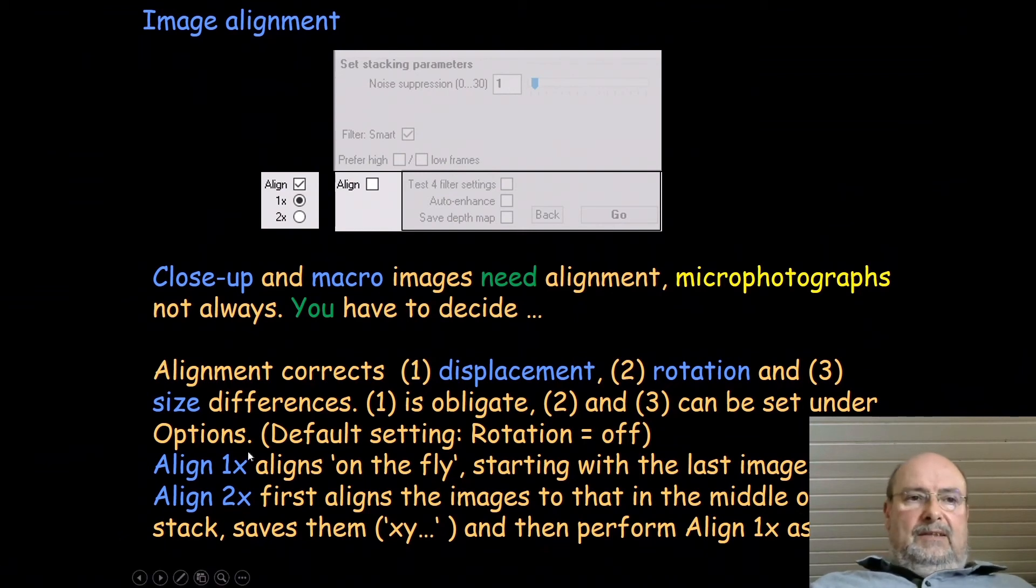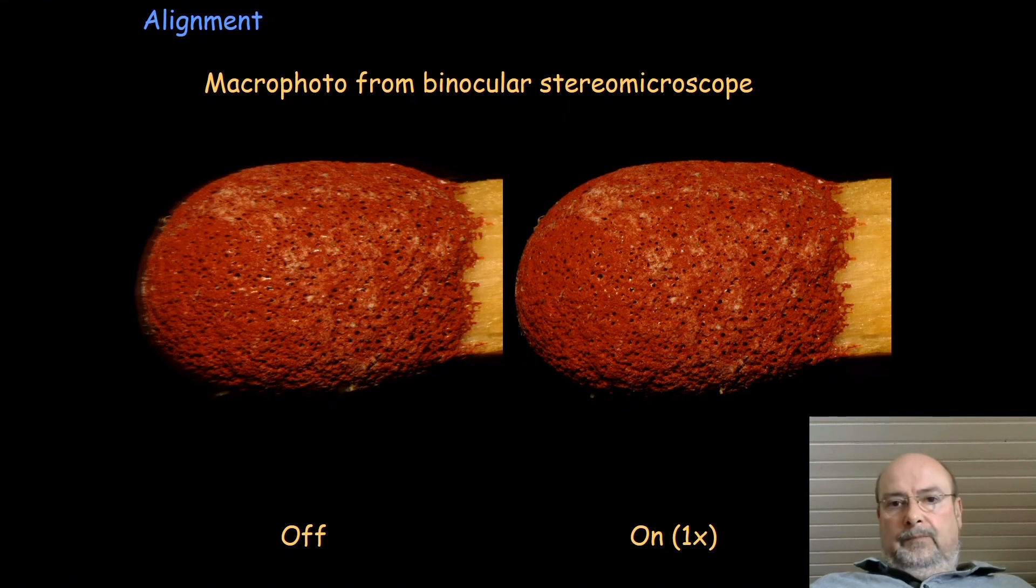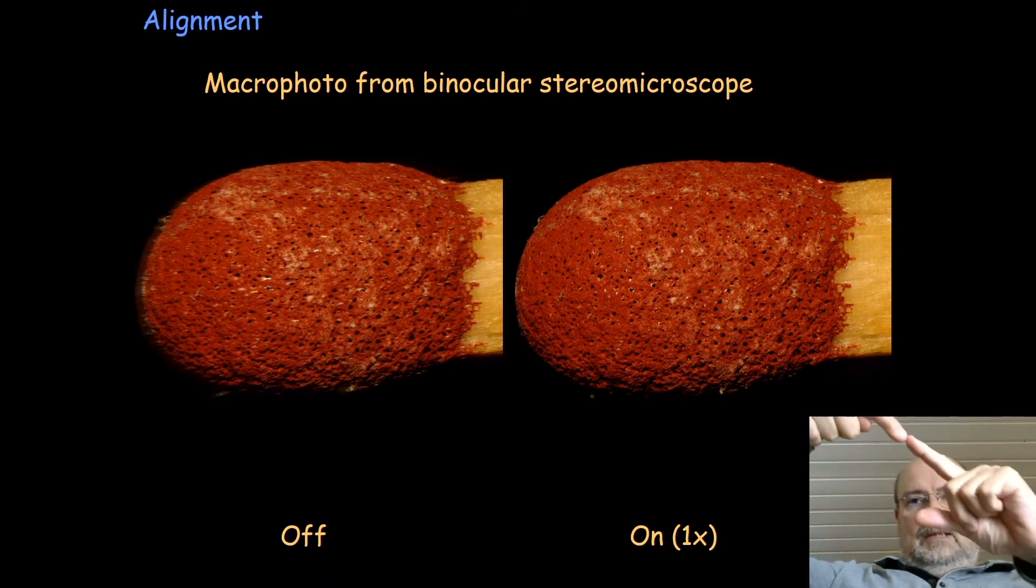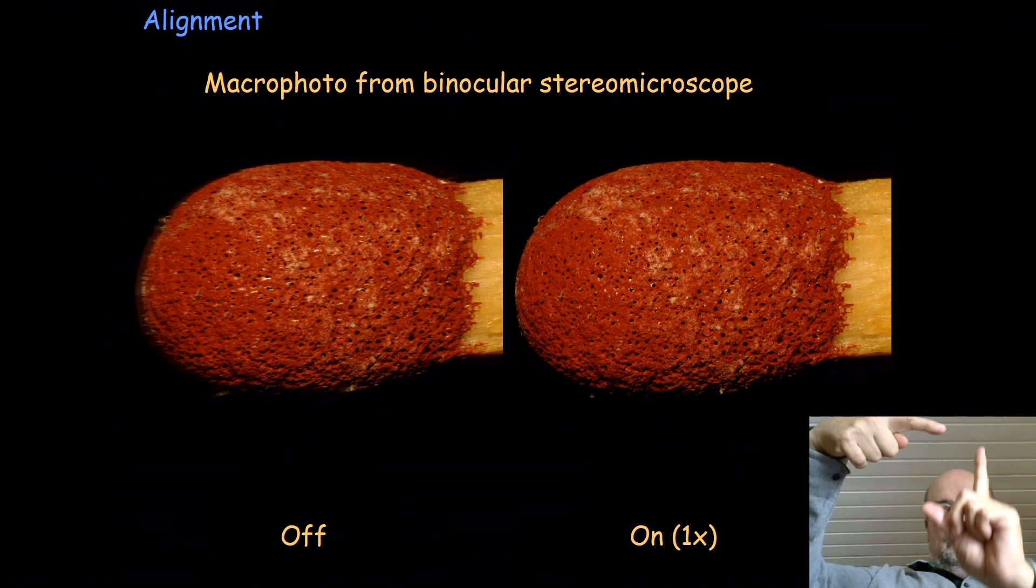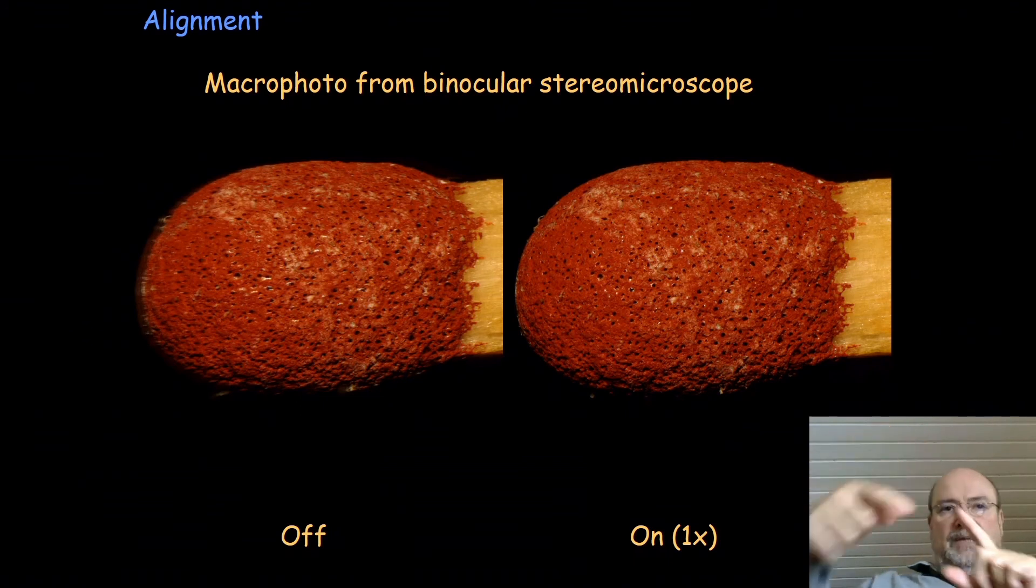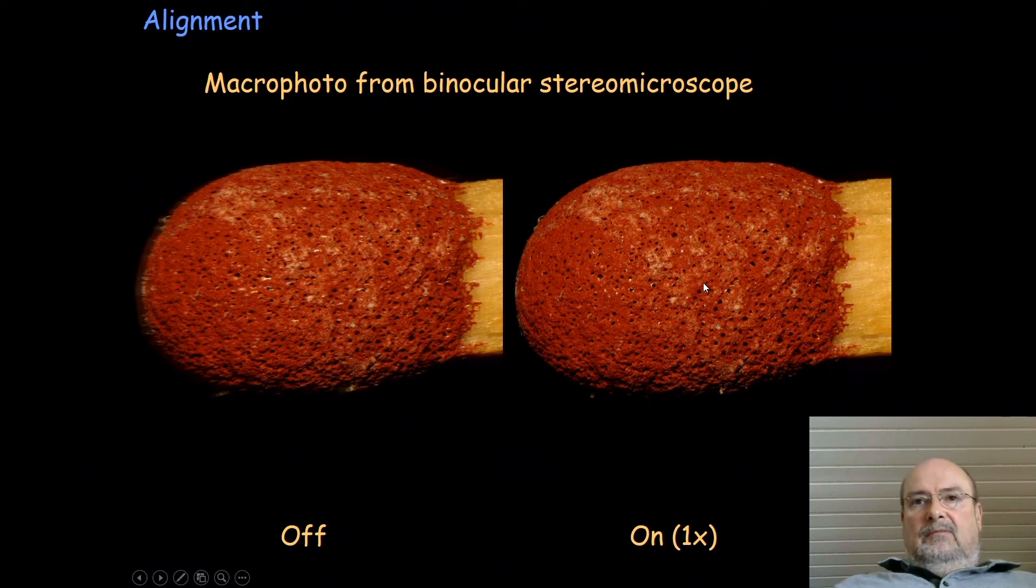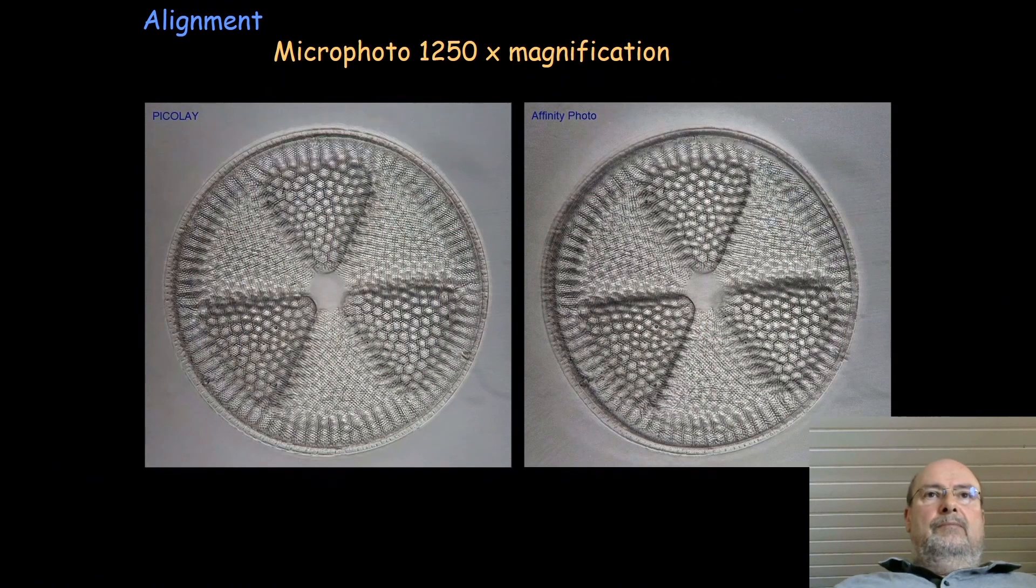Here we have examples. This is a macro photo from a binocular stereo microscope. If you have that, you really need the alignment. If you don't do it, it's not a nice result. You can see these white dots are becoming lines. When you're looking with a stereo microscope and you're changing the focus, it will not be in line with your optical axis. Therefore you have to do some corrections to see the same point of the object in the same point of the picture. This is mandatory in that case, no question.